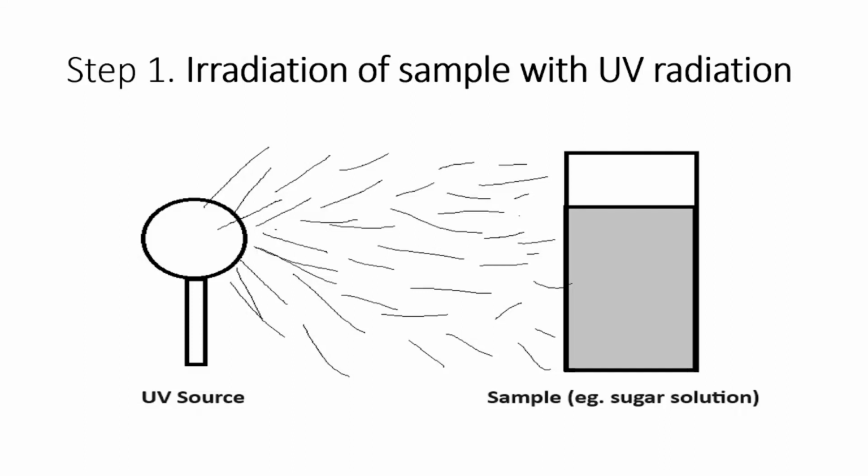Let's say you have poured your sample into the cuvette, like this rectangular container is showing. You can see that this colored part of the container represents our sample, and I said sugar solution, so just for representation sake. So this is our sugar solution, and when you put it into the spectrophotometer, we expect the sample to get irradiated by what?